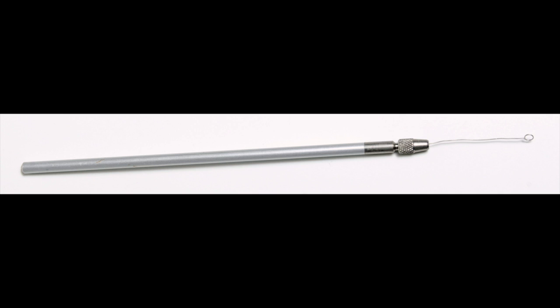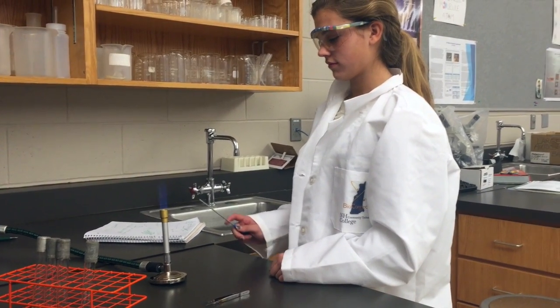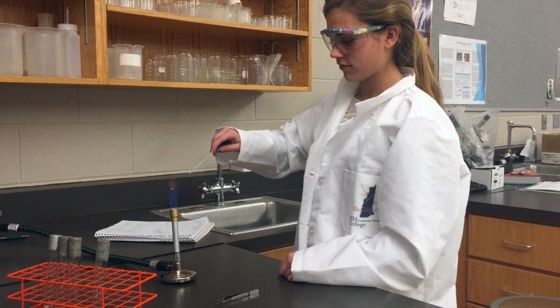In addition to forceps, you will also be working with a piece of equipment called an inoculating loop. This loop can be used to transfer bacterial colonies from agar plates to another media source. When flaming the inoculating loop, hold the wire part of the loop into the flame until it gets red hot.